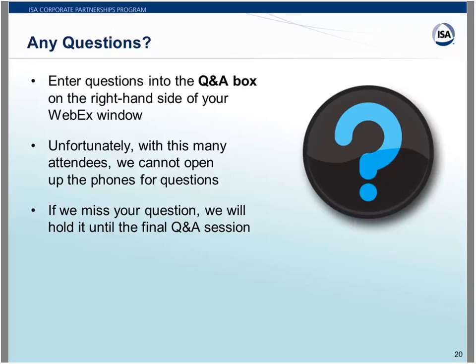Okay, so the first question that has come in is, what are relative startup costs for offline versus inline? The offline is the laboratory, the training, the benchtop analyzer, reagents, continuous, versus the inline.